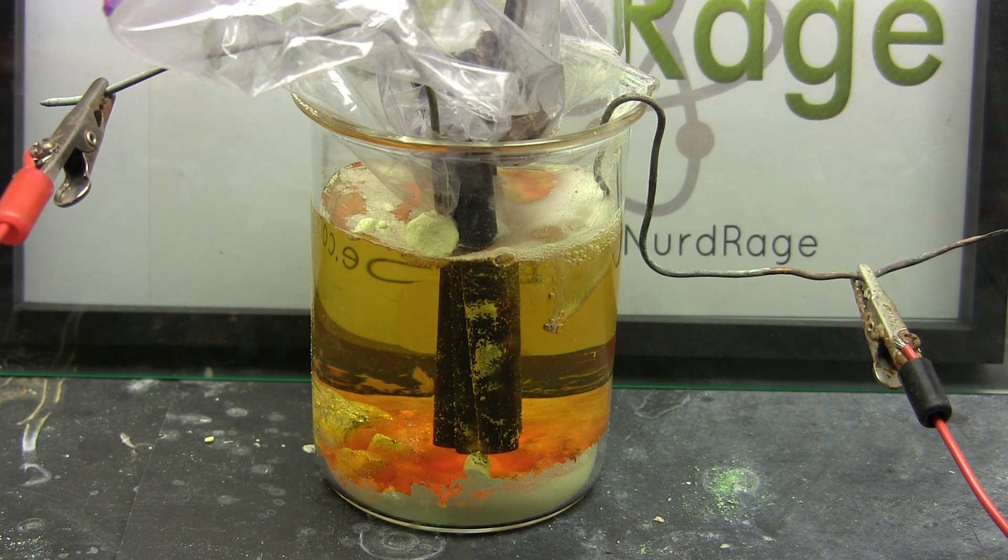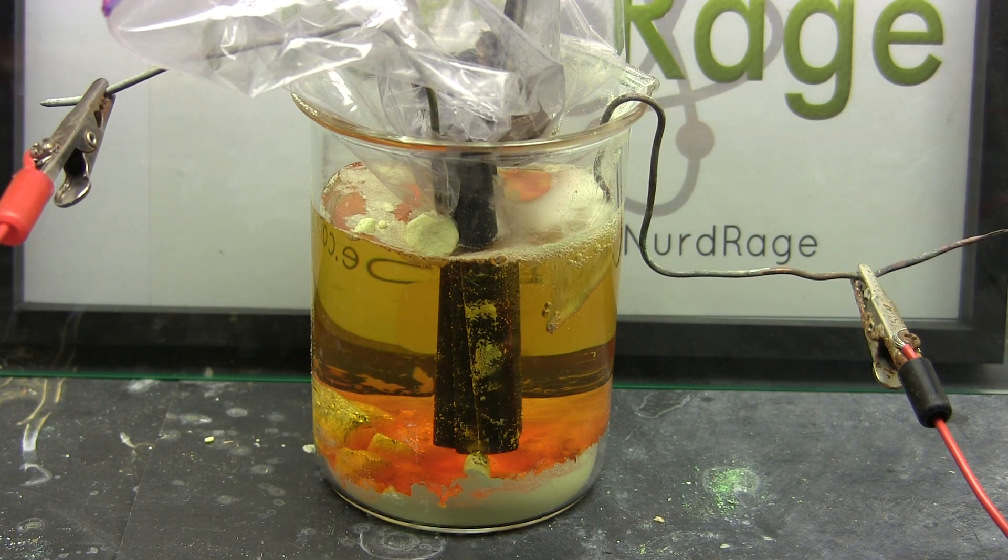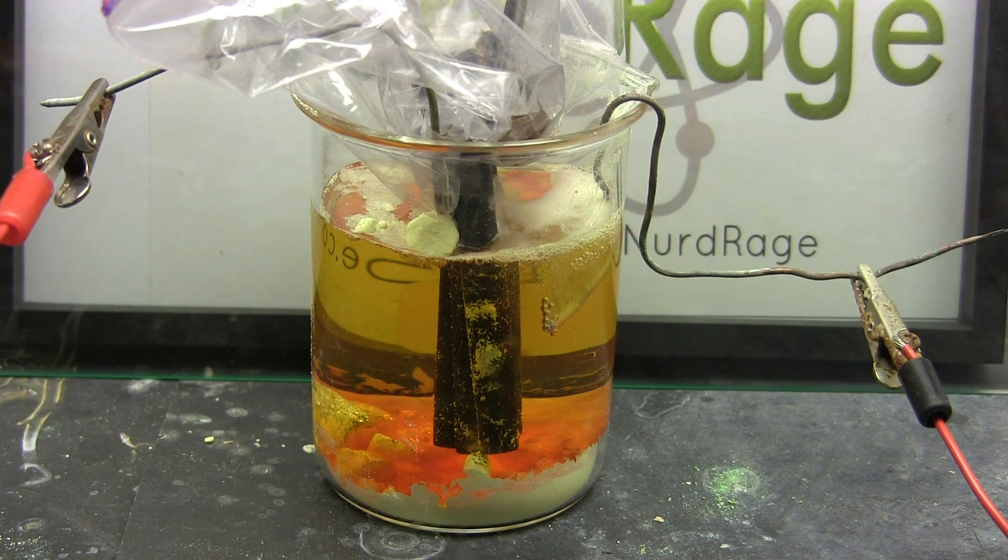We place the copper wire cathode high in the cell because we don't want it reaching into the tribromide and reducing it. This converts it back into bromide ions and wastes our electricity. So keep the copper cathode as close to the surface as possible.